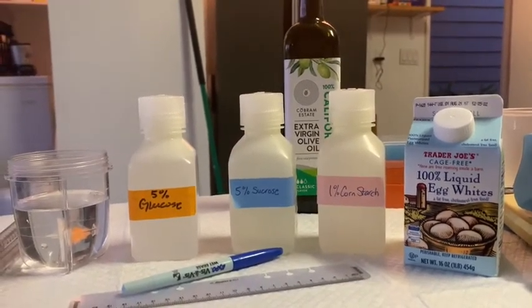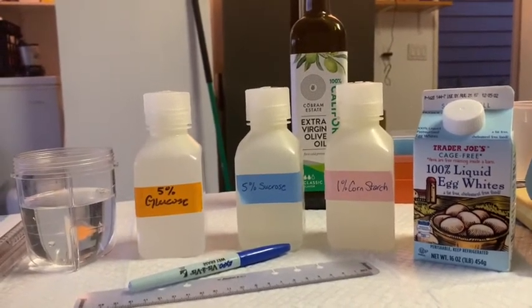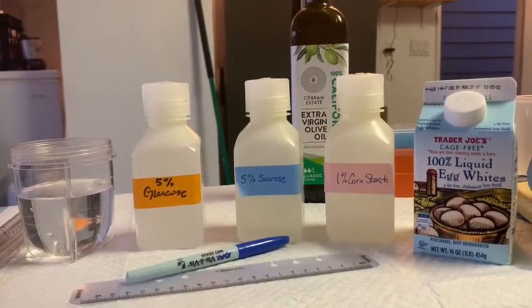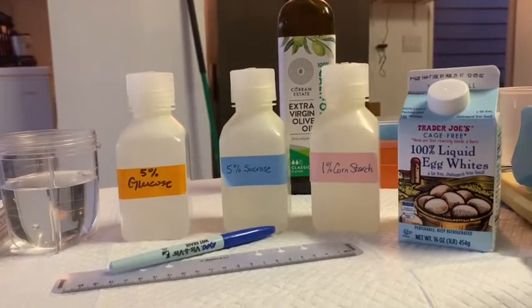For our fat assay, the extra virgin olive oil would function as our positive control — and it doesn't matter that it's extra virgin olive oil; any oil will do. For each of these assays, water is going to serve as our negative control, which will show you what the assay looks like when it doesn't work, while positive controls show you what the assay looks like when it does work.